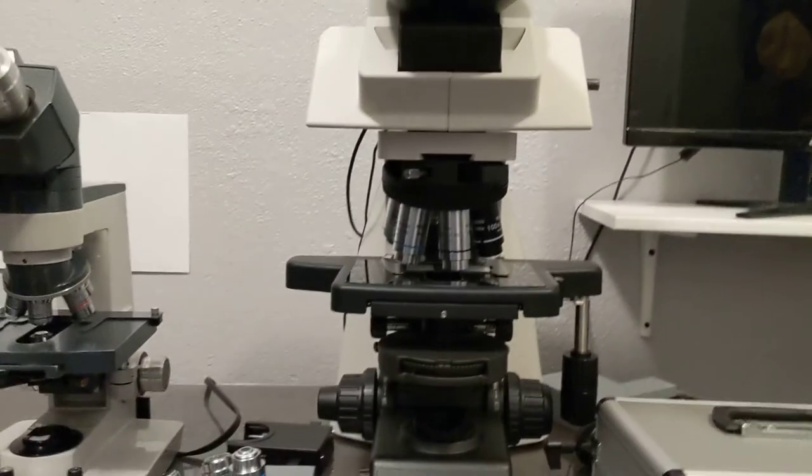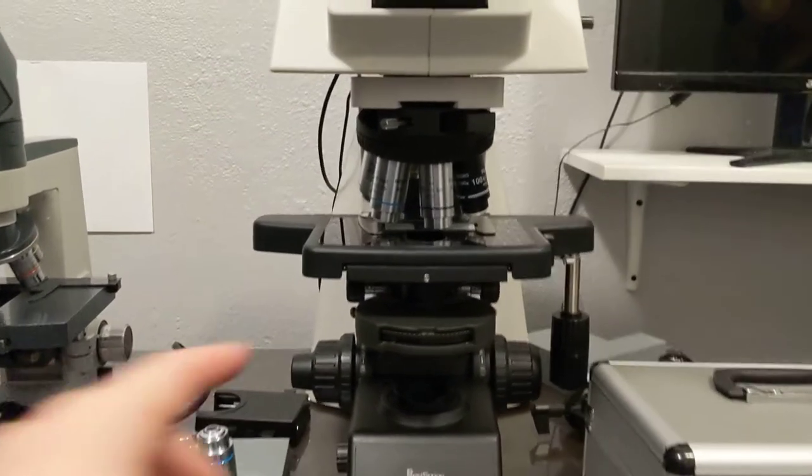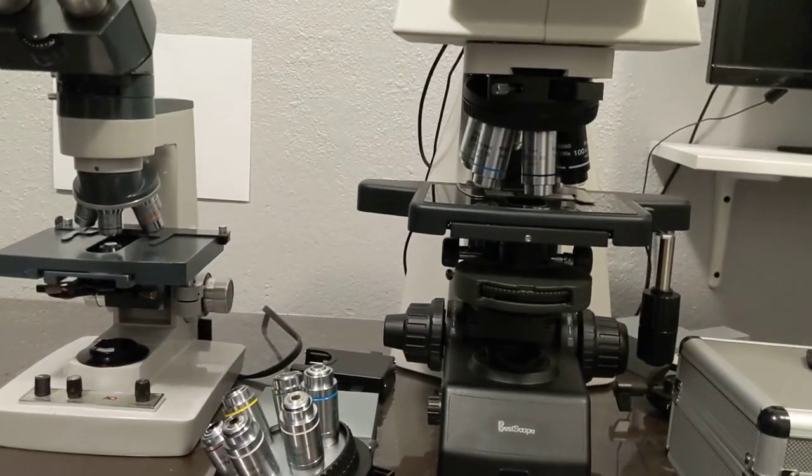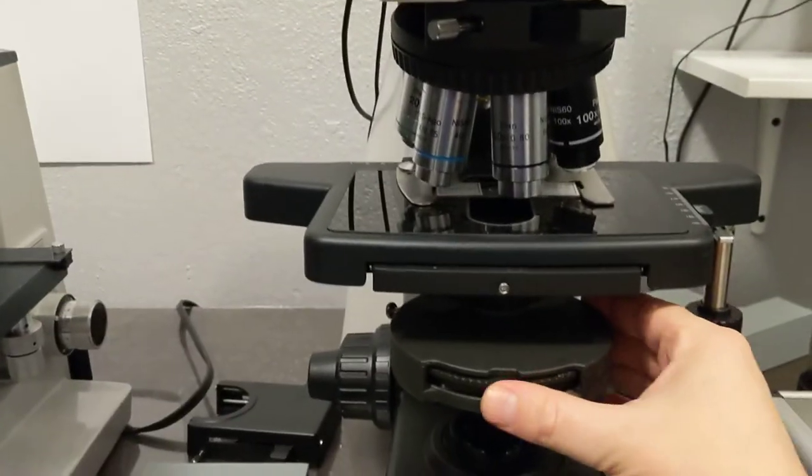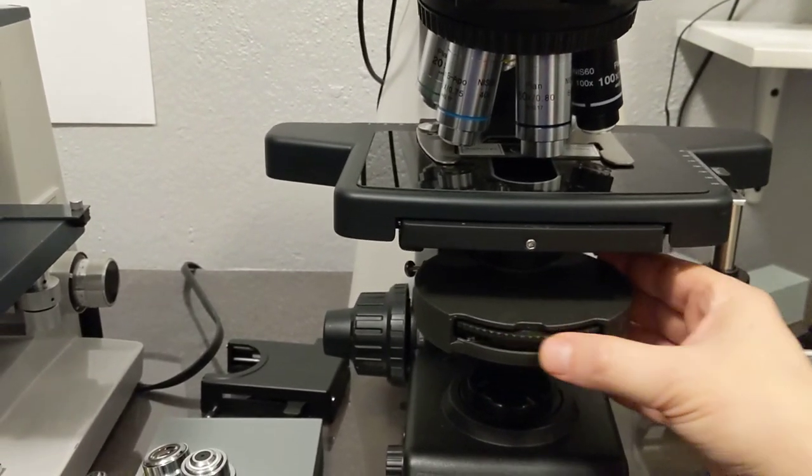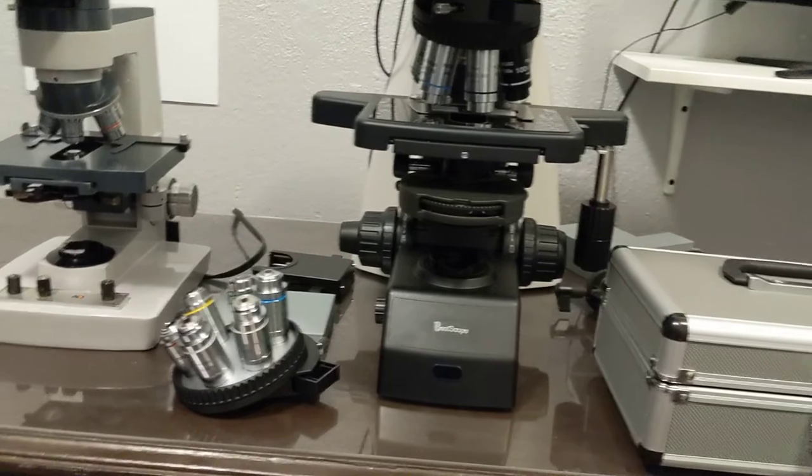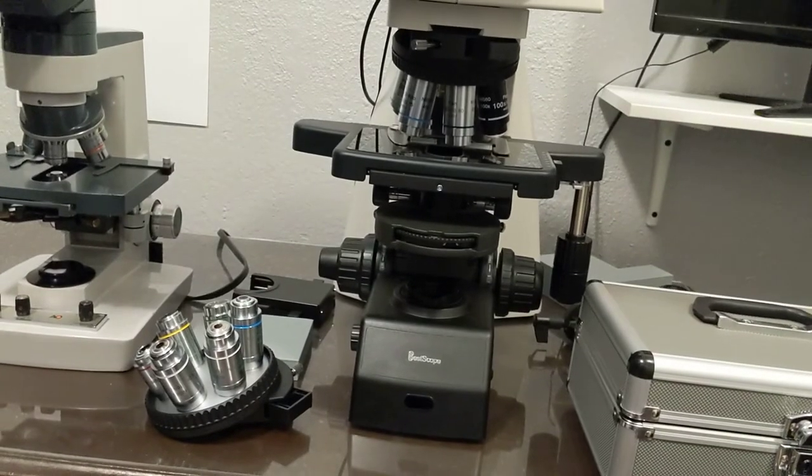Let me talk about the DIC system. This is one of the cheapest ways to get a new DIC system out there. The DIC system costs just a little bit over $3,000 if you include everything. This is the DIC condenser, physically identical to the phase contrast condenser. Except instead of annuli, it's got prisms. There's one prism for 10, one for 20 and 40. Each of those prisms is like $550. Since I thought I don't use 100, I didn't buy it. Now I wish I had it because I'm using 100x.